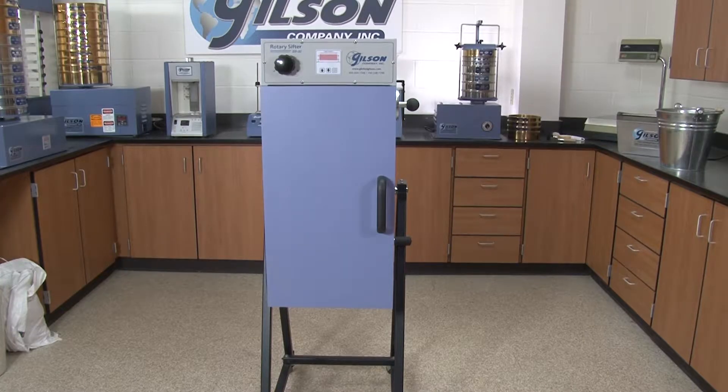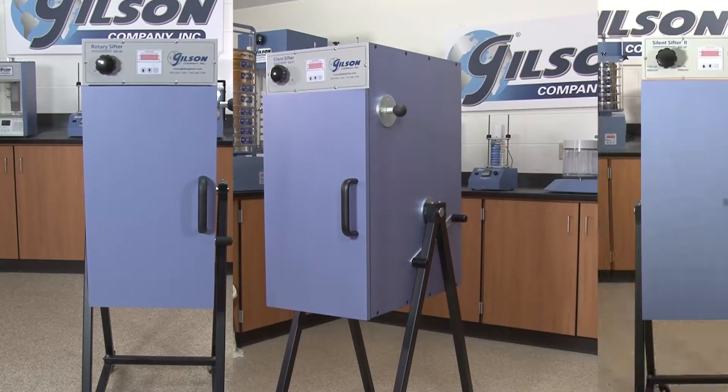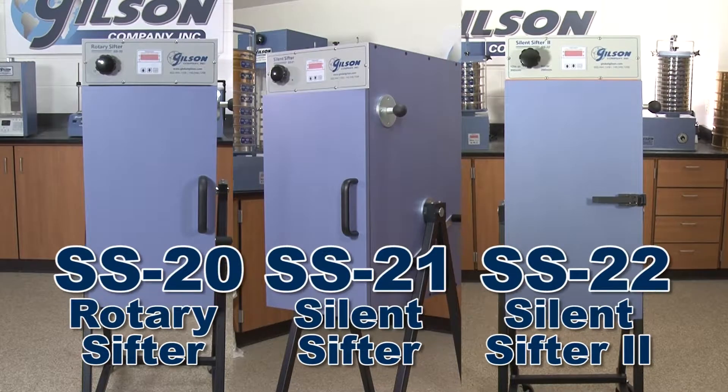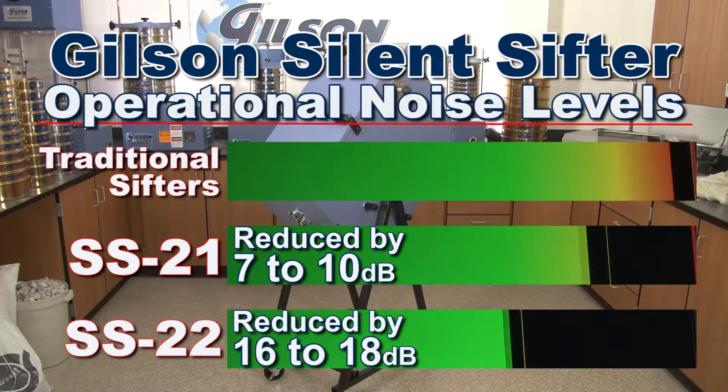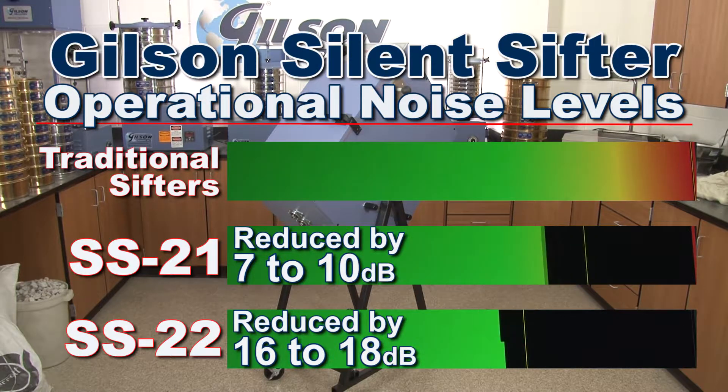Gilson's SS20, 21, and 22 rotary sifters with tapping offer advanced design and easy-to-operate functionality. And the proprietary silencing technology used by the Gilson silence sifters significantly reduces operational noise levels for enhanced worker protection.